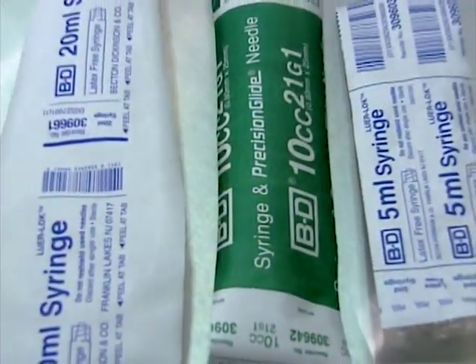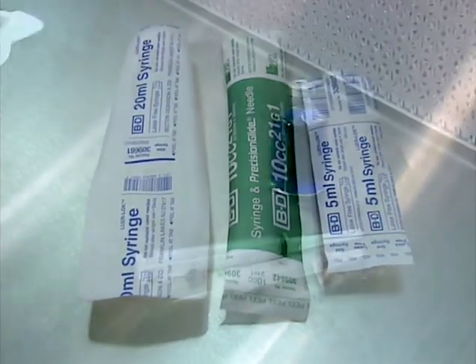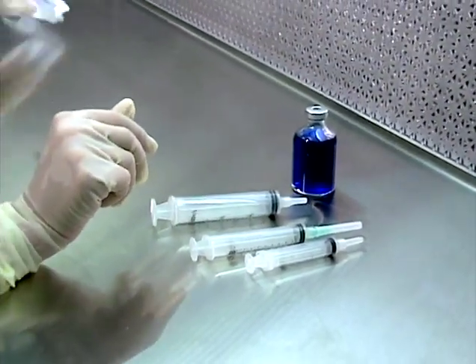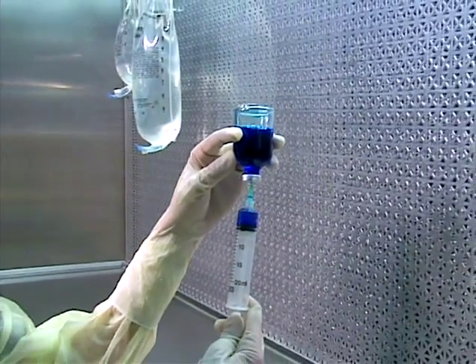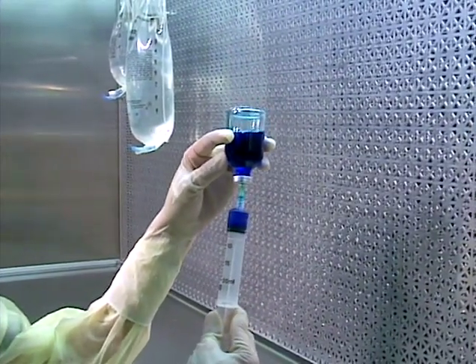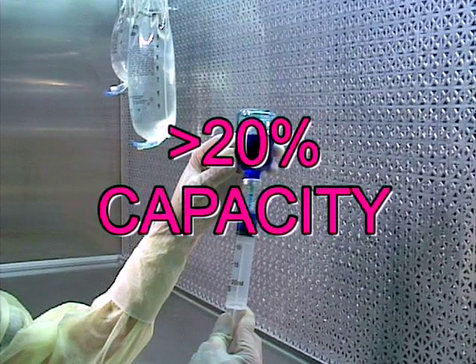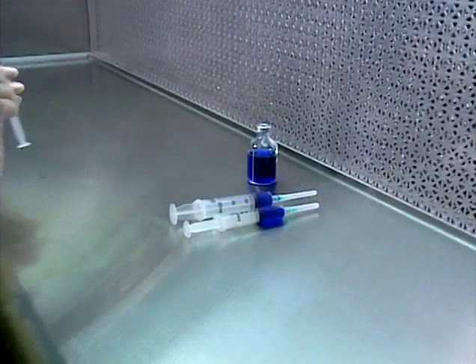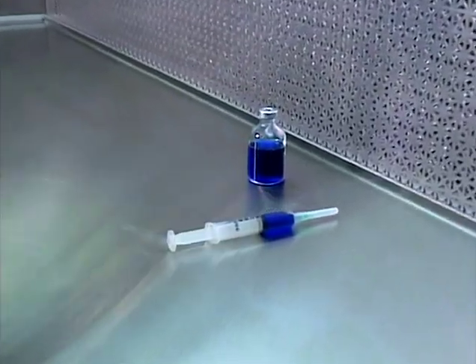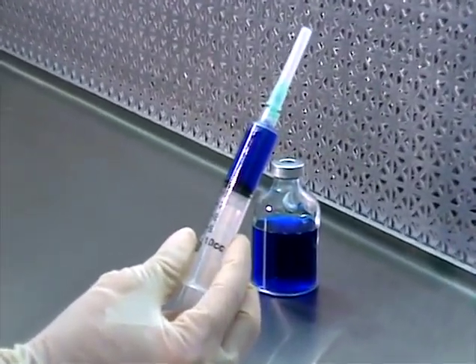When selecting syringes, be sure the syringe is large enough to accommodate the volume required and allow some leeway for adjusting the final dose and removing bubbles. When compounding hazardous materials, the syringe should never be more than 3/4 full. However, it is desirable to use the smallest syringe possible to increase accuracy. The volume to be drawn up should always be at least 20% of the syringe capacity. All syringes used for compounding hazardous drugs should have Luer-Lock type needle attachments, and dispensing pins for hazardous materials must have hydrophobic filters.